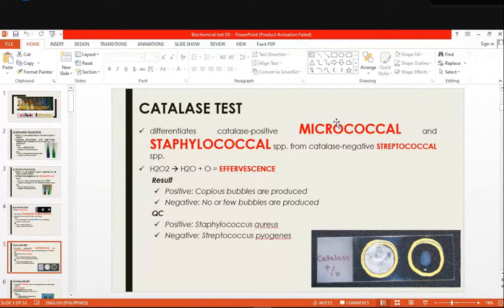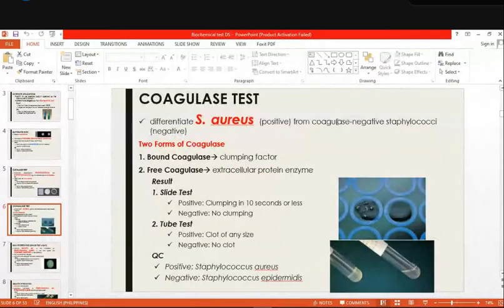Now we get into the next. We get into our coagulase test now. So coagulase, again, is another enzyme. It is an enzymatic protein, a thermostable thrombin-like substance which converts fibrinogen into fibrin, resulting in clotting or clumping. So the coagulase enzyme also acts as a virulence factor in some organisms. Why? It interacts with the fibrinogen present on the host cell surface. So organisms with coagulase usually have a protective barrier around themselves, increasing their pathogenicity and resistance against the immune system.